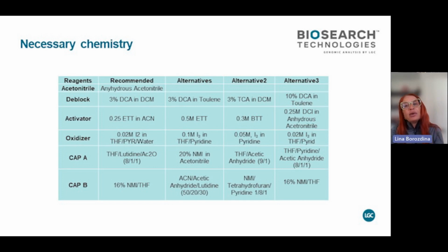However, you have to be careful with it because acid is extremely strong and it does affect each base differently. So if you use a really high percent for your DNA, for example, you will see a lot of depurination and deamination on your bases, hence creating mutations further down.